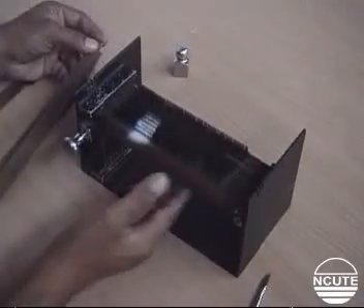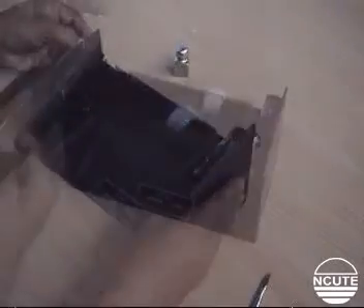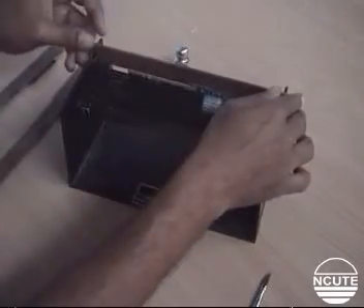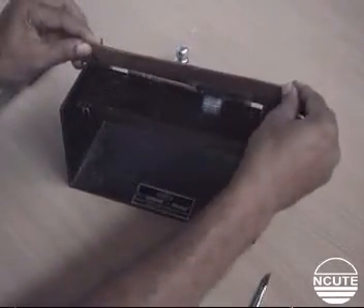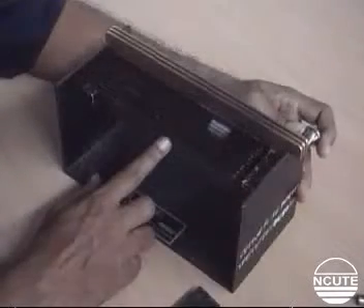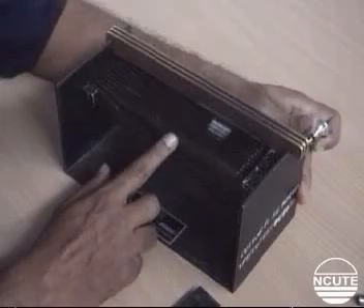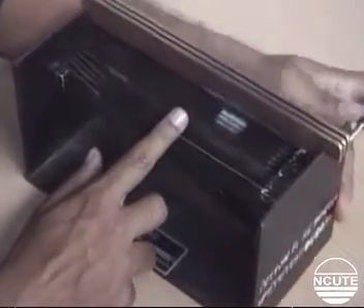Now turn the instrument so its front faces the operator and insert the top combs over the bottom combs. These combs help to grip the fibers well and prevent their slippage in the next step. Drop the bottom combs successively one by one until the tips of the longest fibers in the tuft are visible.